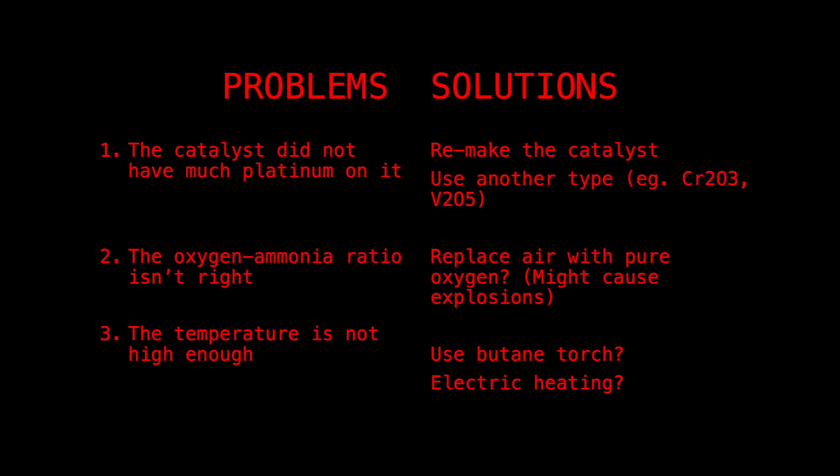The third point is the temperature. I think it was quite apparent that the alcohol burner did not do a very good job on controlling the temperature to be high, because according to my research, the industrial setting for this Ostwald oxidation requires something like 800-900 degrees Celsius. But I seriously don't think the alcohol burner worked up to that temperature. So maybe I'll try using a butane torch, or maybe even do an electric heating, just like in the industrial setups.